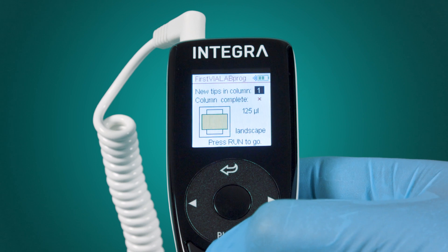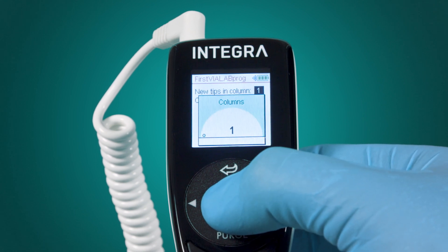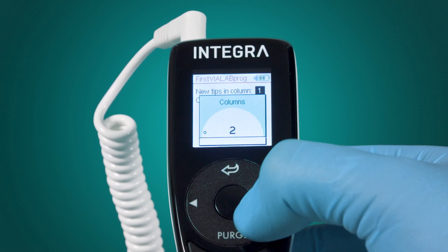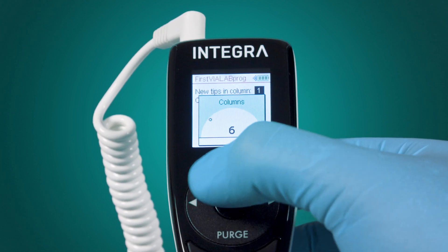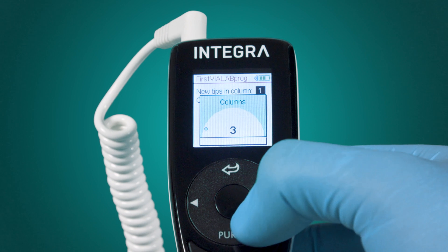The tip loading screen displays the tip box type and the orientation of the tip box, which need to be loaded. Here, the position of the next available tips can be changed.